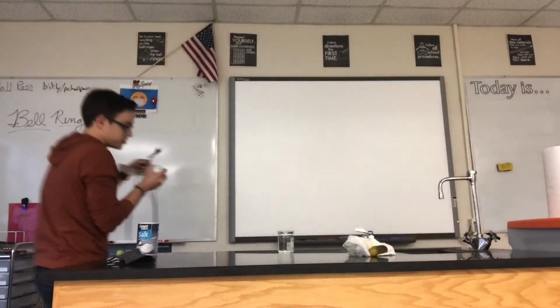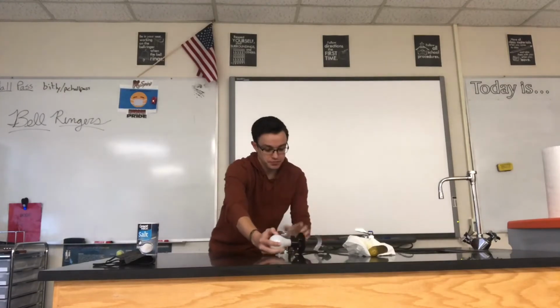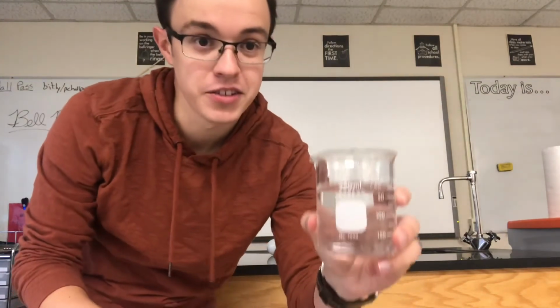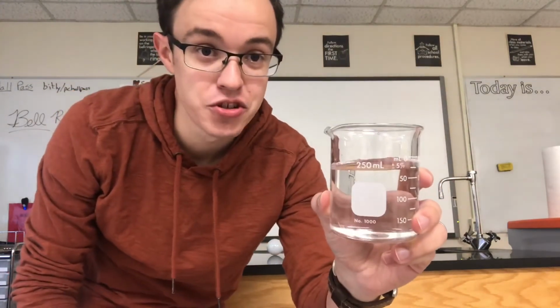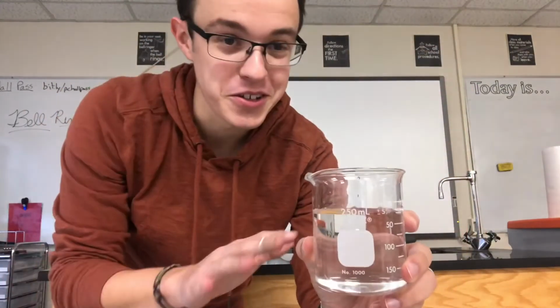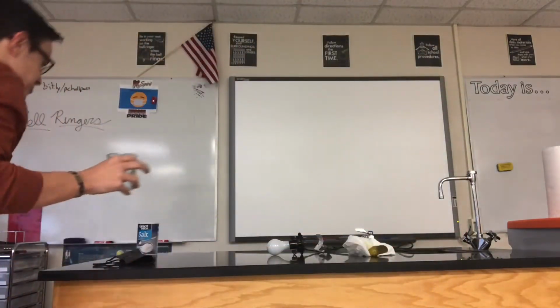Okay, now let me show you this. This is the water. This is distilled water I got from down the hallway, where everyone fills up their water bottles, okay? So this is pure H2O right here. No tricks, no magic tricks. I just wanted to show you what we've got going on.